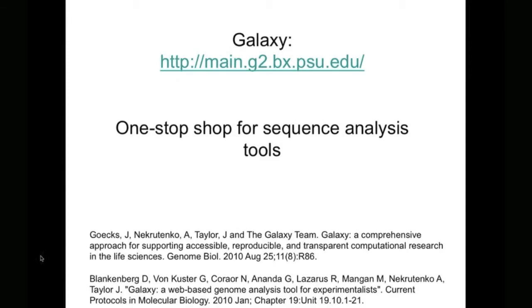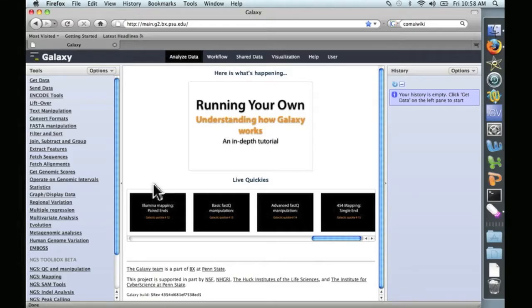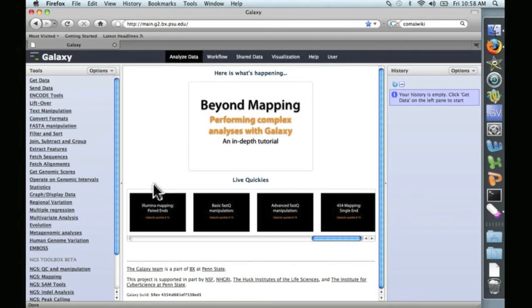The primary tool that we're going to use is a tool called Galaxy. Galaxy is sort of a one-stop shop for sequence analysis tools. This is a website where you upload your sequence, and then there you can perform any number of modifications and manipulations and analyses. And then you can send those results to others, you can publish them, etc. Let's go ahead and enter the site. And here's the Galaxy website.